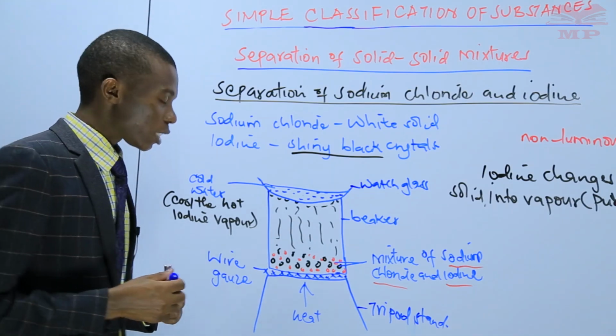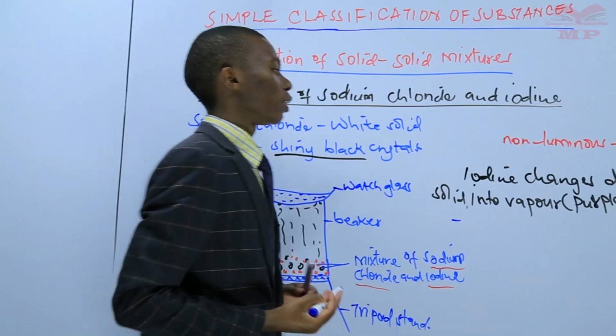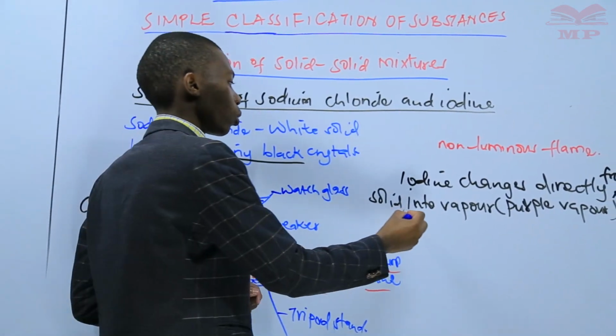Then any substance which is able to turn from a solid to a gas, we say that process is called sublimation.